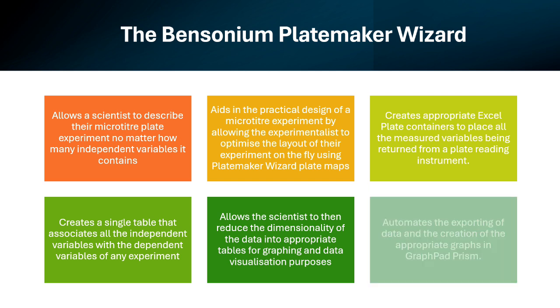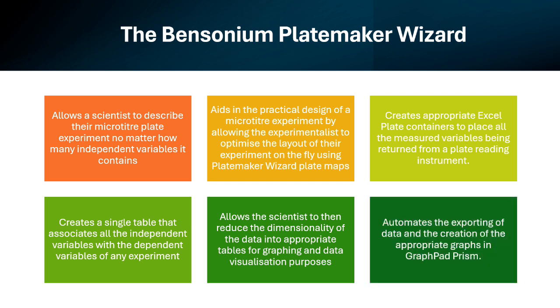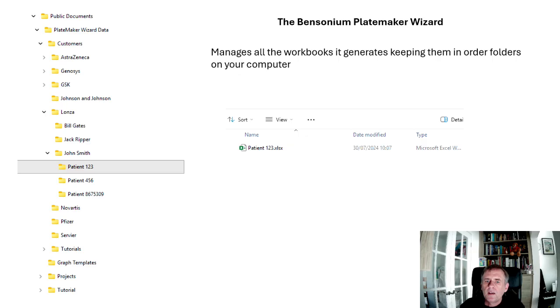purposes, and practically this means that it can also automate exporting of the data and the creation of the appropriate graphs in GraphPad Prism. And it is this last point that I'm going to demonstrate just to give you a feel for how powerful this program is.